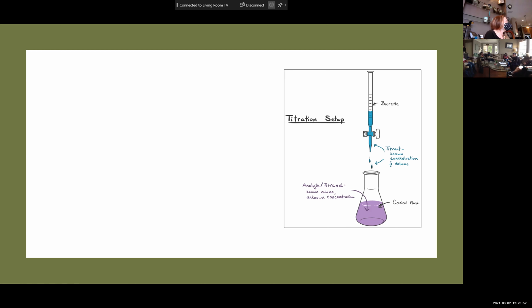concentration. So what were the concentrations of the acid and the base we used today? They had the same 1 molar concentration. 1 molar. Do you remember what they were last week? 0.1 molar. Yeah. They were 0.1. So obviously the one we used today was how many times more concentrated than last week? Yeah, 10 times more concentrated.